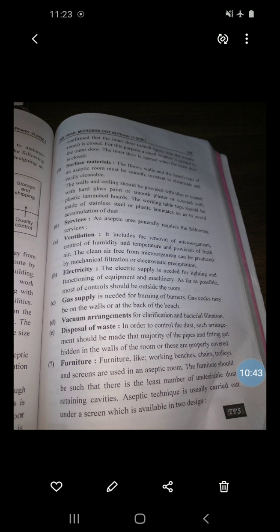Then next is furniture. Furniture like working benches, chairs, trolleys and screens are used in the aseptic room.